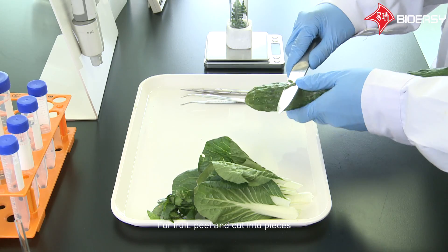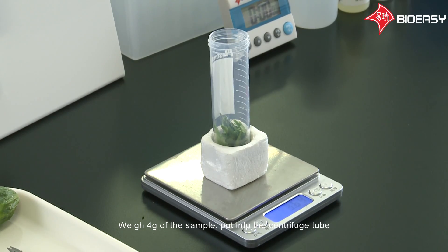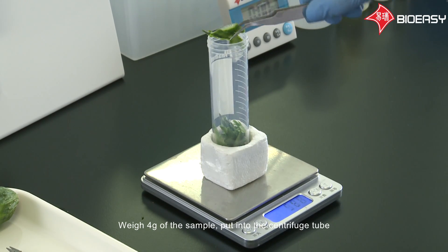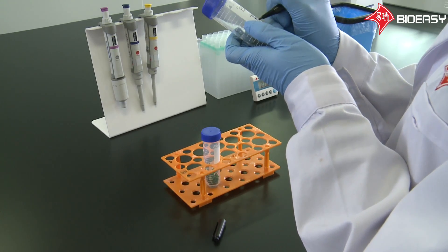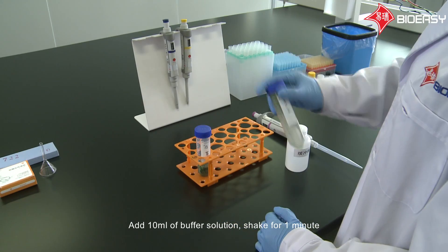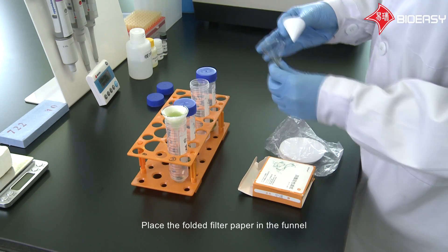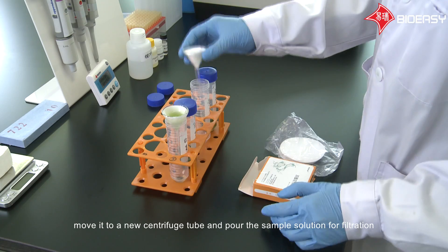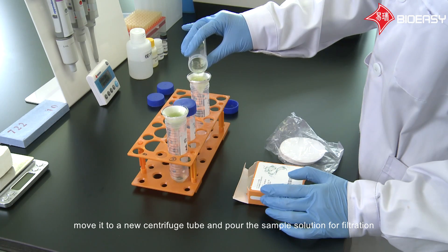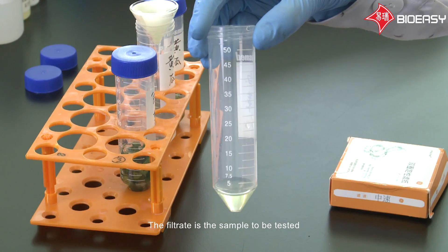For fruit, peel and cut into pieces. Weigh four grams of the sample and put into the centrifuge tube. Mark the sample. Add 10 milliliters of buffer solution, shake for one minute, then put in a standing position for another one minute. Place the folded filter paper in the funnel, move it to a new centrifuge tube, and pour the sample solution for filtration. The filtrate is the sample to be tested.